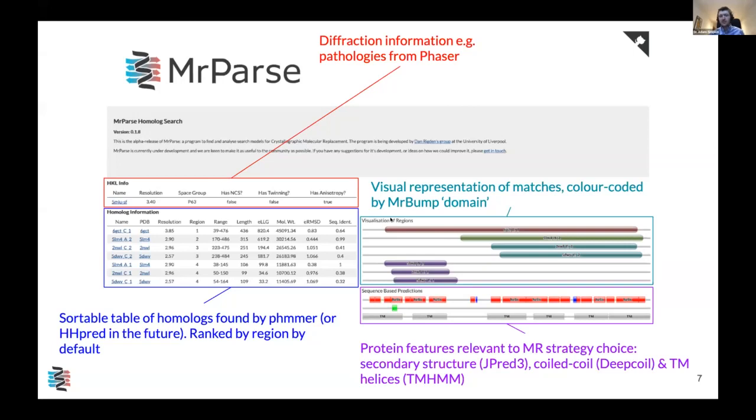But let's say we tried that in molecular replacement and it failed. We might also look down the list and see this is actually probably a two-domain protein. There are these domains over here on the right, and then these domains on the left. That second entry is 99% sequence identity, so it's got a better sequence identity. It also has a really high eLLG. That would perhaps work better in case there may have been some sort of conformational change in the protein.